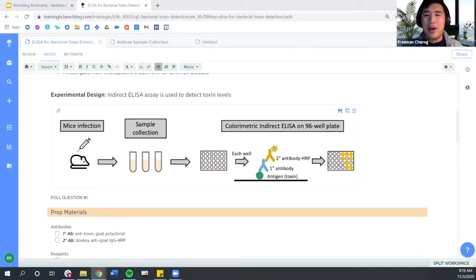Great. Thank you all for your inputs. I'm glad to see a wide variety of functionality that you're all looking for out of the Benchling Notebook, both as an observation-based note-taking tool, but also as a source of truth for any experimental protocols. So hopefully, as we finish this training today, you'll be able to see both the flexibility of a notebook entry and its ability to be a singular source, both for qualitative observations as well as quantitative recorded data.